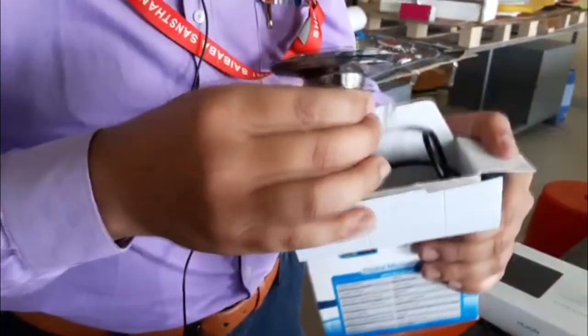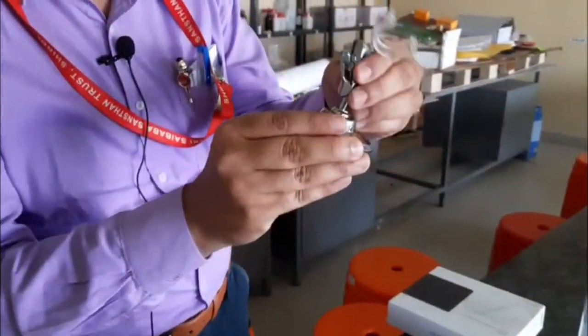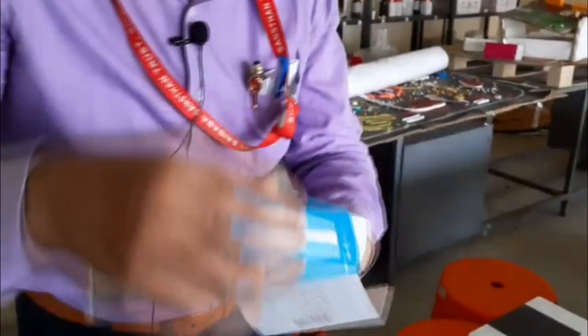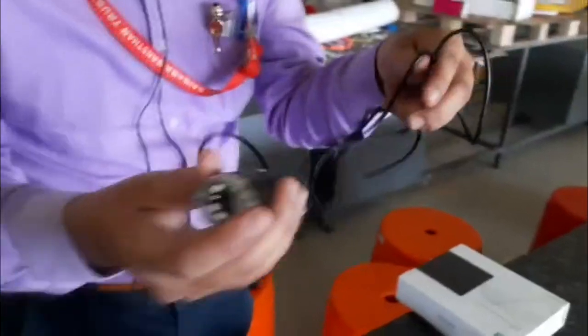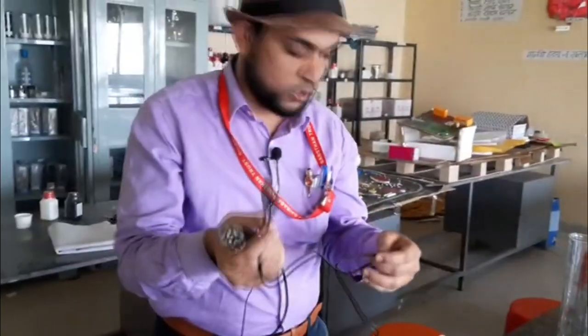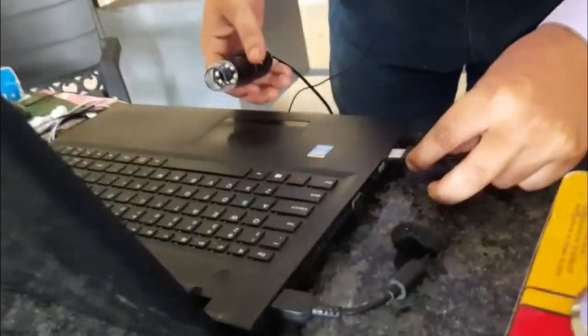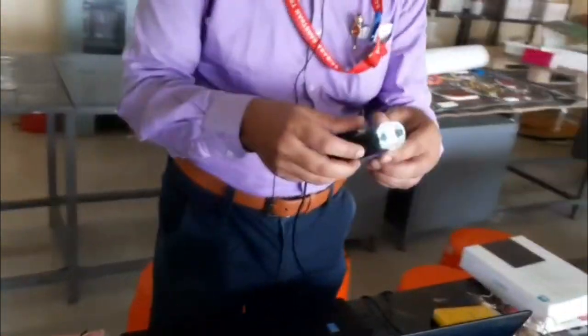Inside the box is the stand, which has a very sleek design. It can move 360 degrees. The microscope connects via a USB cable which can be inserted into your laptop, or it can also be operated on your mobile. I will show you both methods. I'm inserting the USB cable into the laptop now.